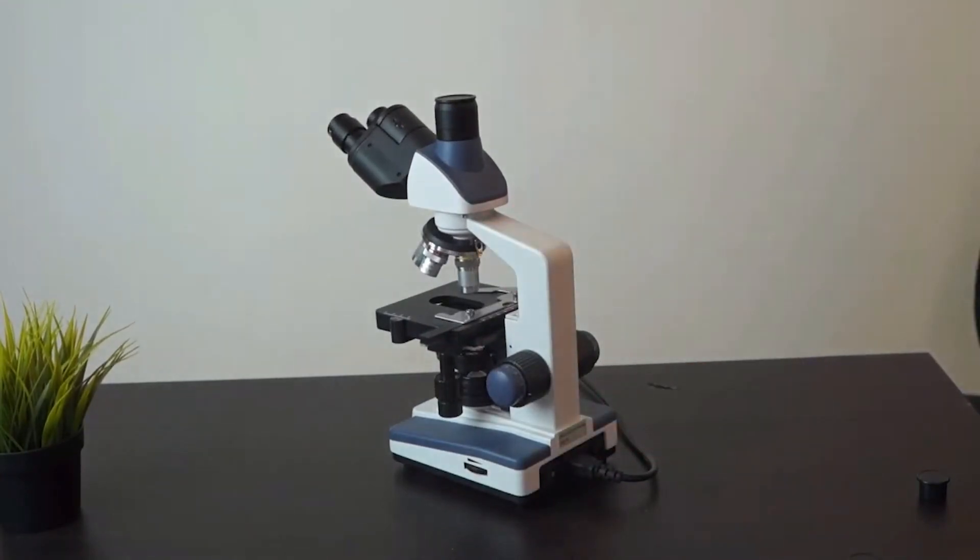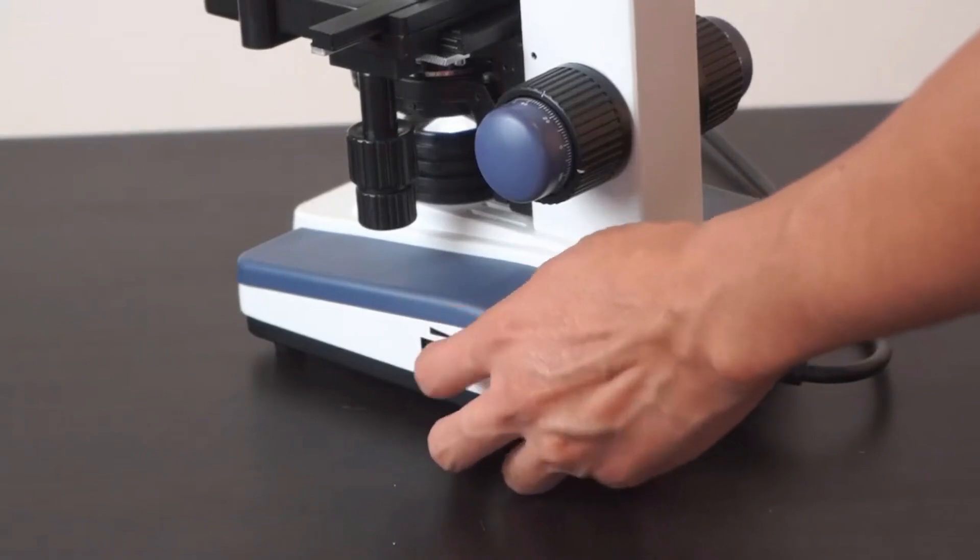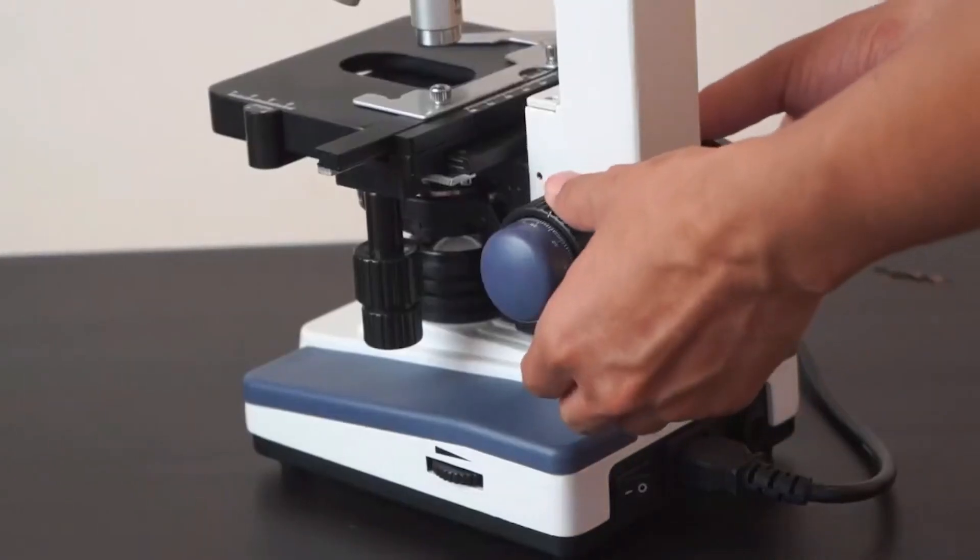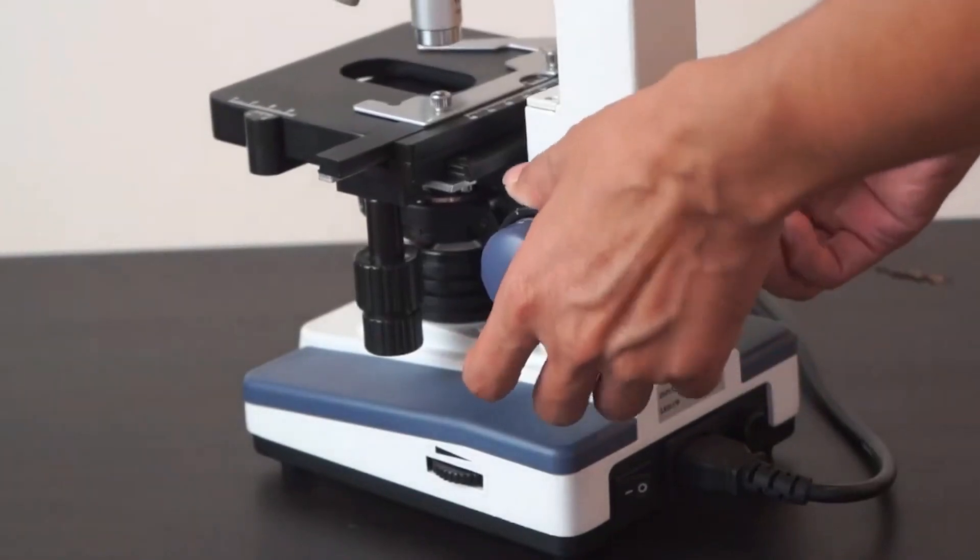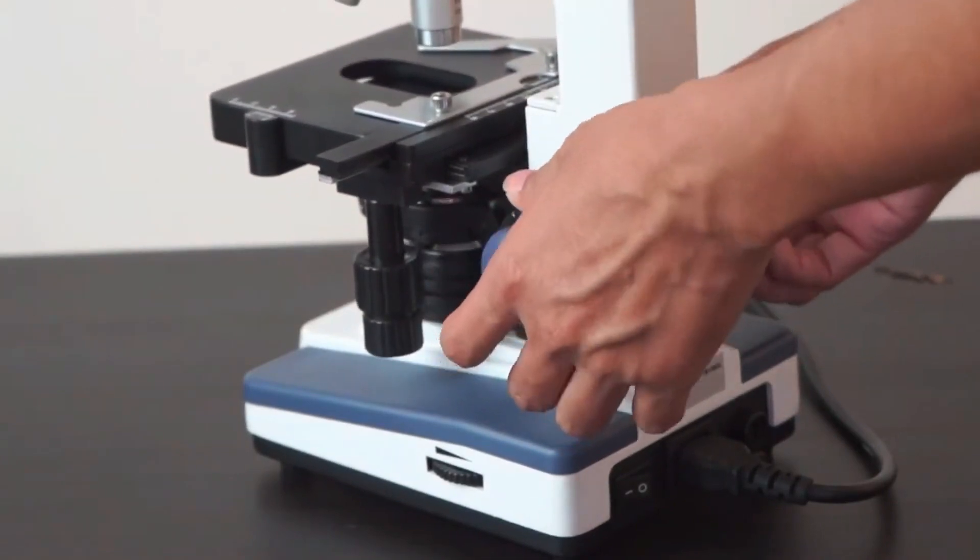With 6 wide-field magnification settings: 40x, 100x, 250x, 400x, 1,000x, and 2,500x, this microscope caters to various viewing needs.